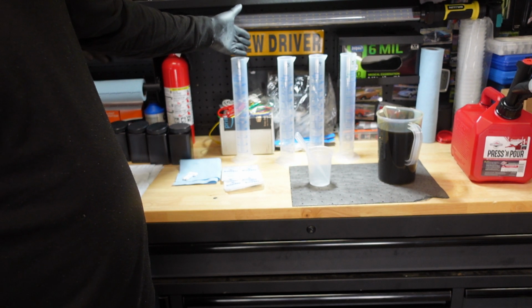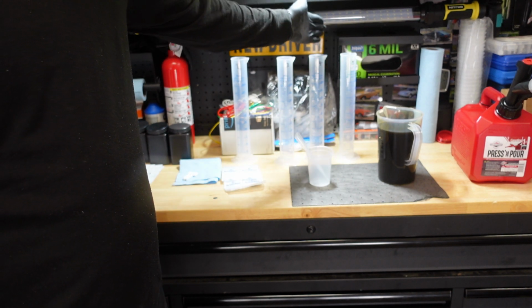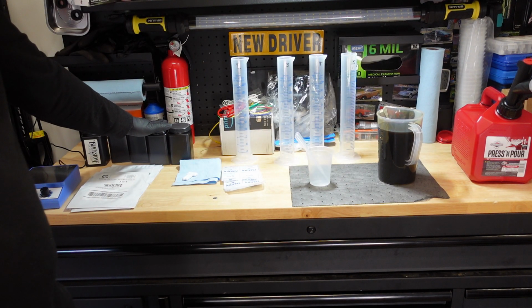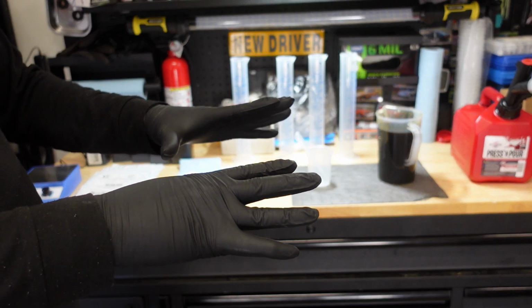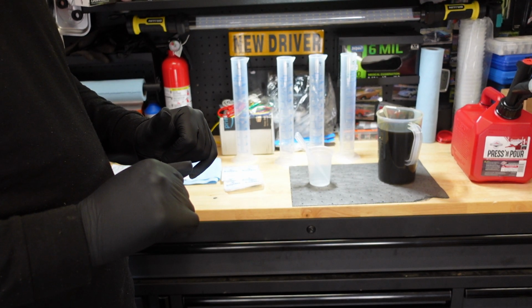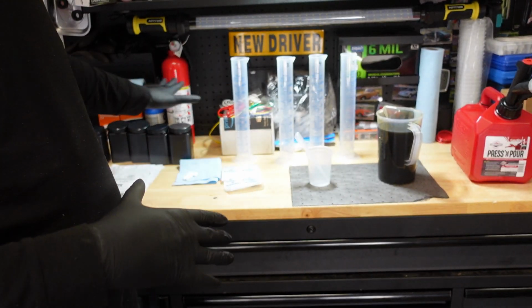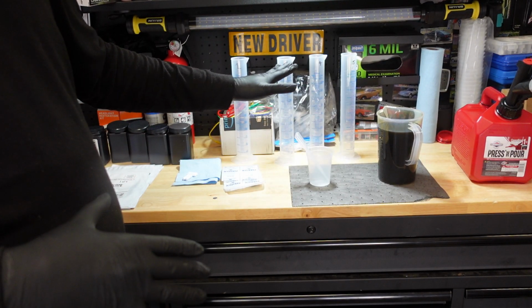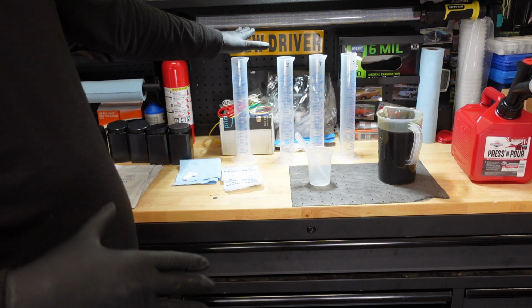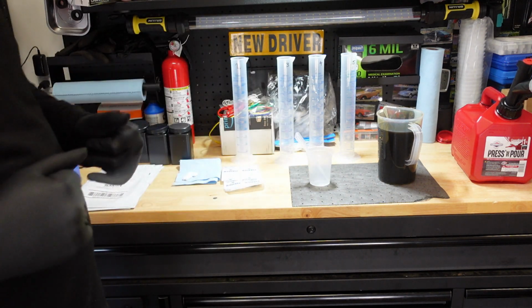And then I'm just going to speed the video up for these right here, because all I'm going to be doing is diluting 2x here, and then 2x from that one, and 2x from that one to here. And then we're going to package these samples up over here and ship them out to Blackstone and see what happens. But again, I'm not telling them that, and for full disclosure, I did communicate with the company to tell them that I would be sending these samples in, but this video will come out after I get the results, and they will not know exactly how much I'm putting in each one to submit. So there you have that.